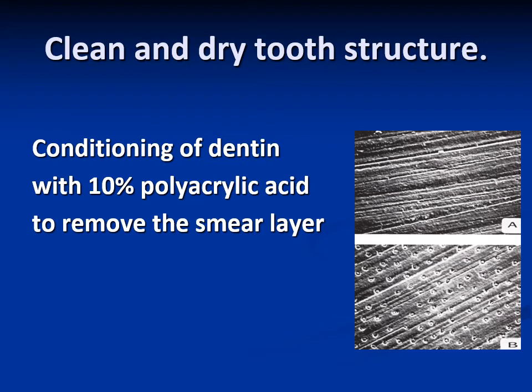This is the smear layer in the first slide, and this is after removal of the smear layer with 10% polyacrylic acid, exposing the dentine, and these are the orifices of the dentinal tubules. This is a transverse section of the tooth.